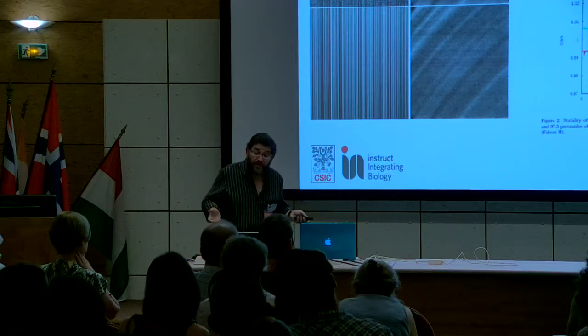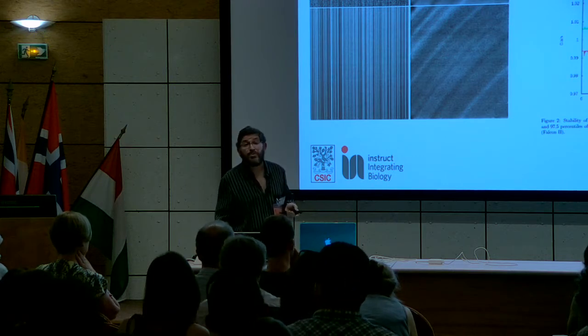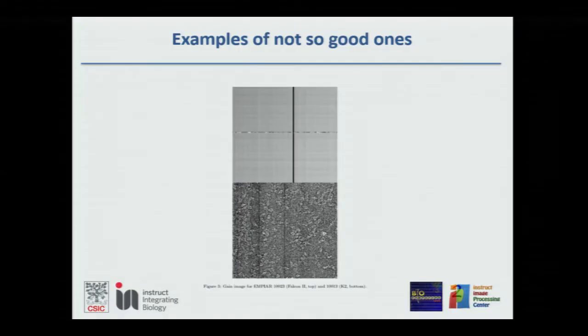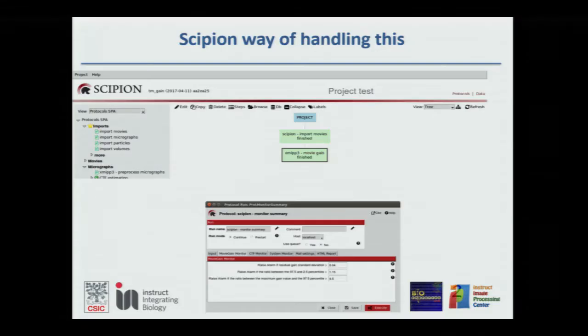So if you have done everything correctly, if now I re-estimate the residual gain, I should have something flat. Okay, in many cases I have. In something like 20% of the cases in the EMDB or the EMPIAR database, I get things that should be flat and are not flat, meaning that gain correction in no way was properly considered. If we had been at that moment in the position to incorporate this into quality controls, the facilities would have been in the position to say, well, something is going on not correctly at the data collection level.